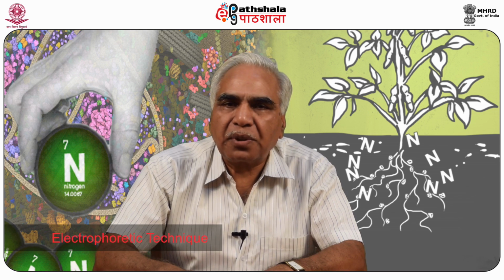Dear students, let us summarize the topic of discussion. Agarose Gel Electrophoresis is a specialized electrophoretic technique. You cannot think that a lab working on polymerase chain reaction is not routinely using this technique. Agarose Gel Electrophoresis is widely used in labs focusing their research on nucleic acids.